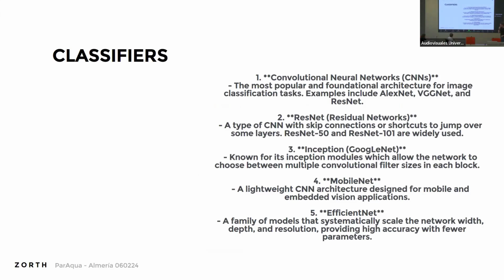So here are a few classifiers. You can build your own convolutional neural network. That's fine. And I would encourage you to build the first one as a hello world example. You really know the tool after that and what to do with it.